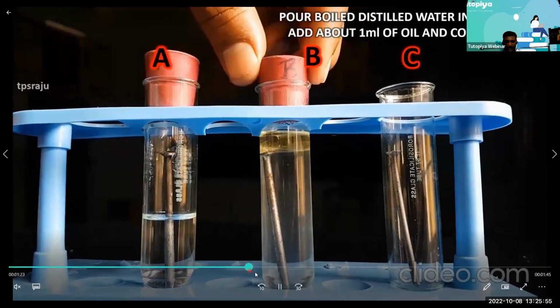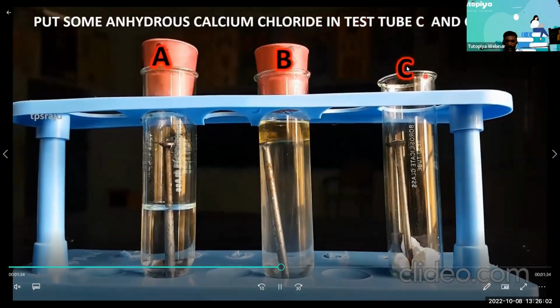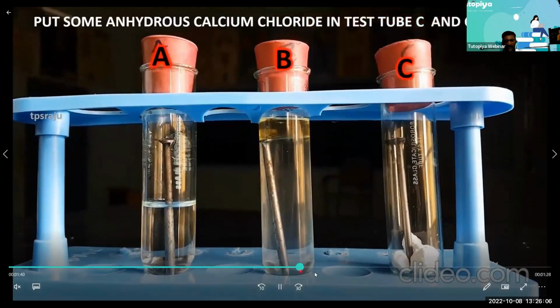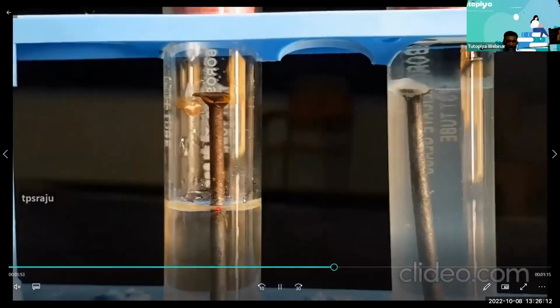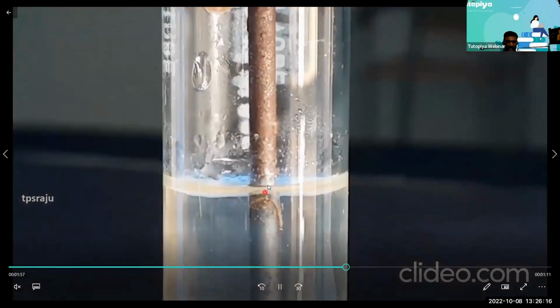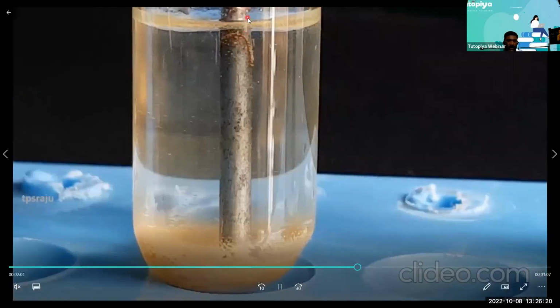And in the third test tube C, I add some anhydrous calcium chloride, hygroscopic salt, and close it with a cork and leave it for a few days, maybe 3 days. And then you come and see. You see that in the first test tube, you see rust. The hydrated ferric oxide, you can see as a reddish brown sticky deposit on the iron nail.